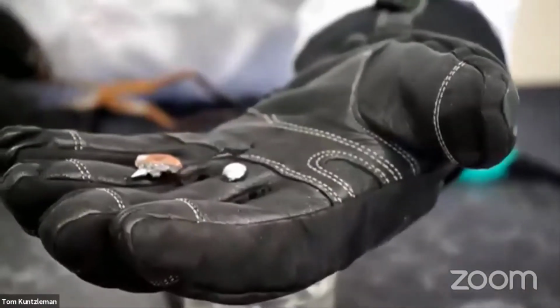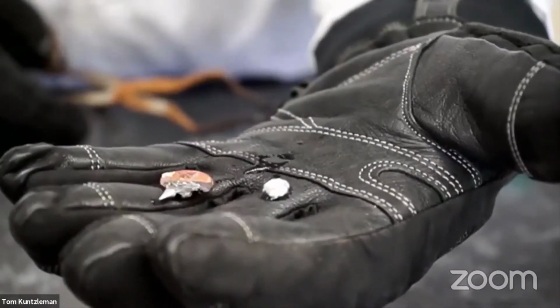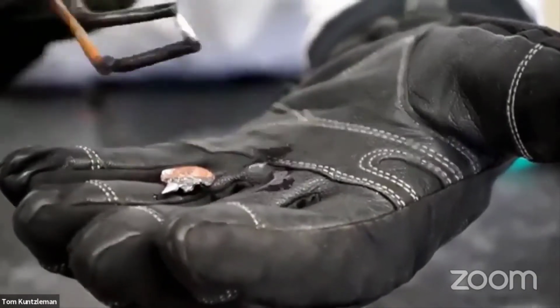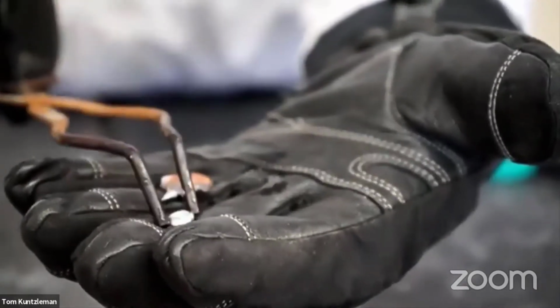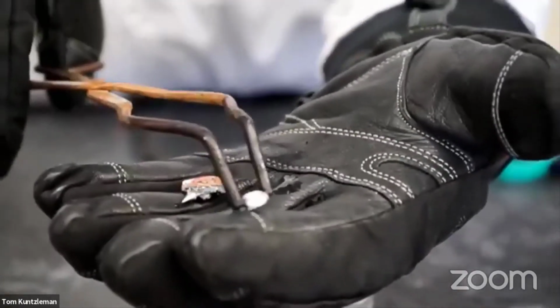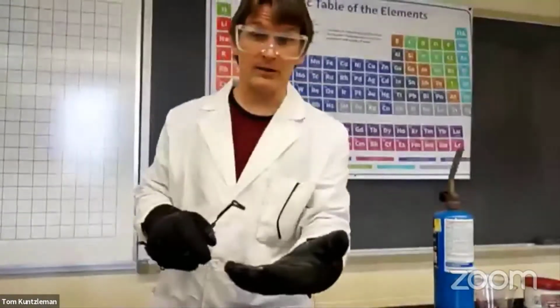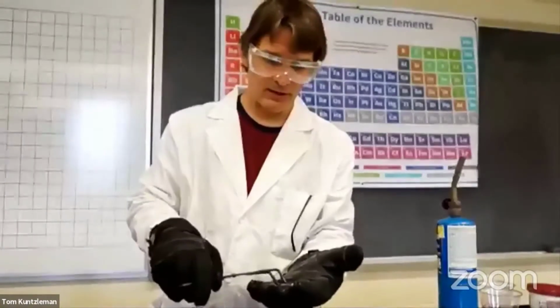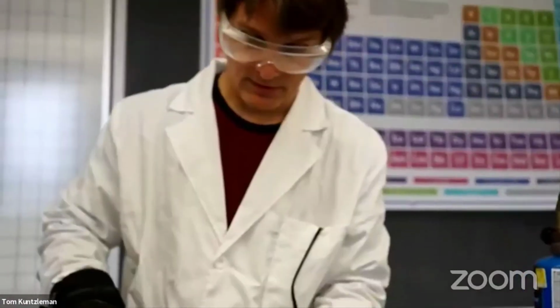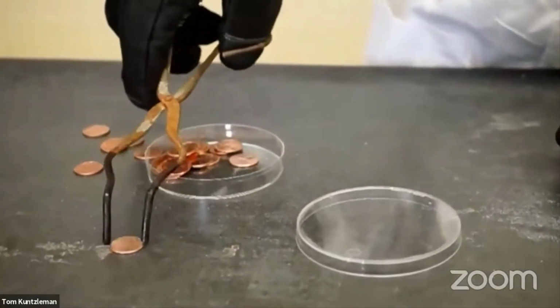That's silvery, all right. New pennies minted after the year 1982 are not actually made of copper. Well, there's a little bit of copper. They coat them with copper, but most of the penny is made of the element zinc. And zinc has a silvery color, and zinc melts pretty easily. It melts at 419 degrees Celsius, a temperature that can be reached using this blowtorch. So the new pennies are made of zinc, and then they coat them with copper because people are used to pennies being made of copper. But that's why they coat them with copper.